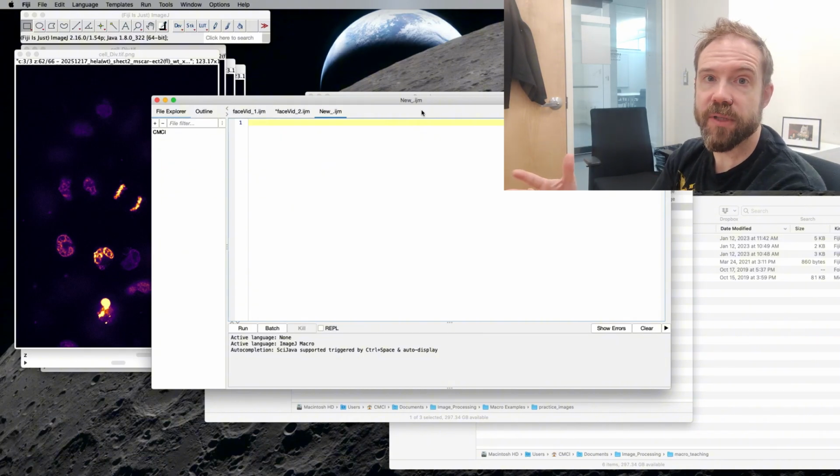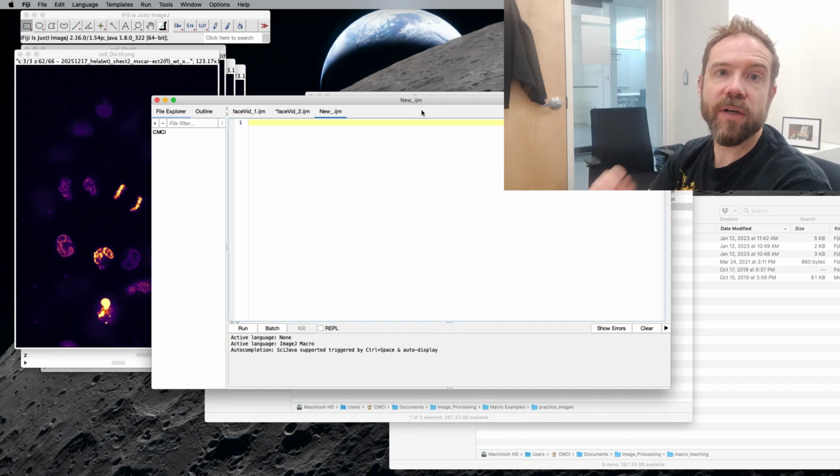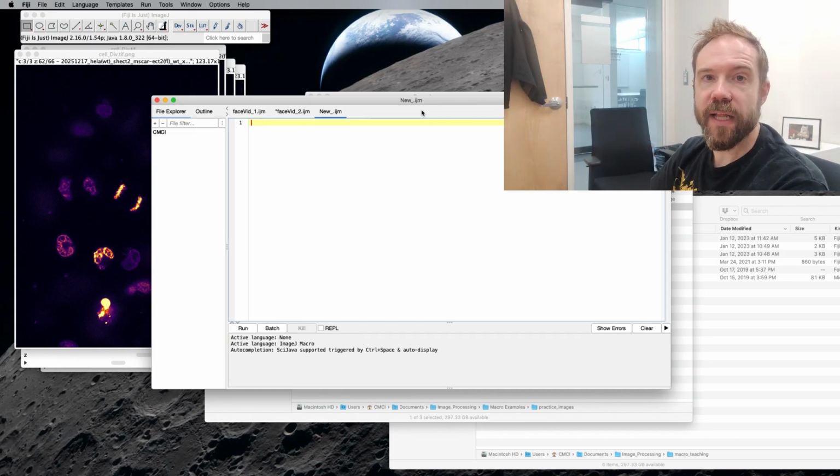Indexing is a fundamental concept in programming that is related to finding where things are in multi-element objects like arrays or strings. So strings are composed of multiple character elements strung together. They are a character string, whereas arrays are multi-element containers that contain either exclusively numbers or strings. In the macro language, that is. In other programming languages, arrays can contain a whole bunch of different things, particularly in Python, where you can have arrays of arrays called lists. Anyway, digressing there.